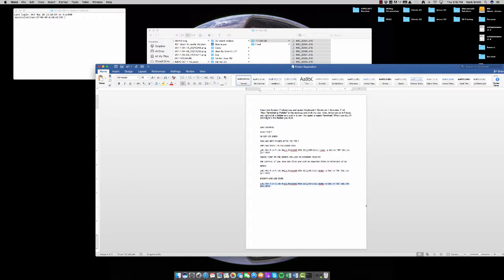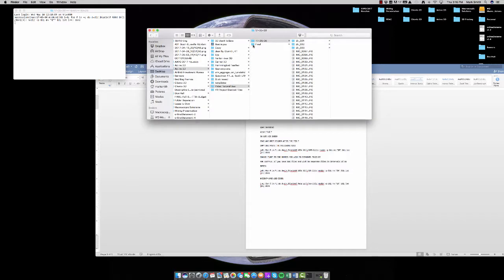So Command-C on a Mac, go right over to your terminal, and the second you paste this command, it's going to apply the function. So you want to make sure that if you make a mistake or anything like that, maybe you have these images copied, because you're going to have to separate them back out if you forget to change the number. So I'm just going to hit Command-V. Now it's going to go through, and it's going to start creating new directories, and it's going to separate out all of these photographs into directories: 1 is going to be your 0 degrees, 2 is 5 degrees, 3 is 10 degrees, and so on. So now I can see all these images are being created.